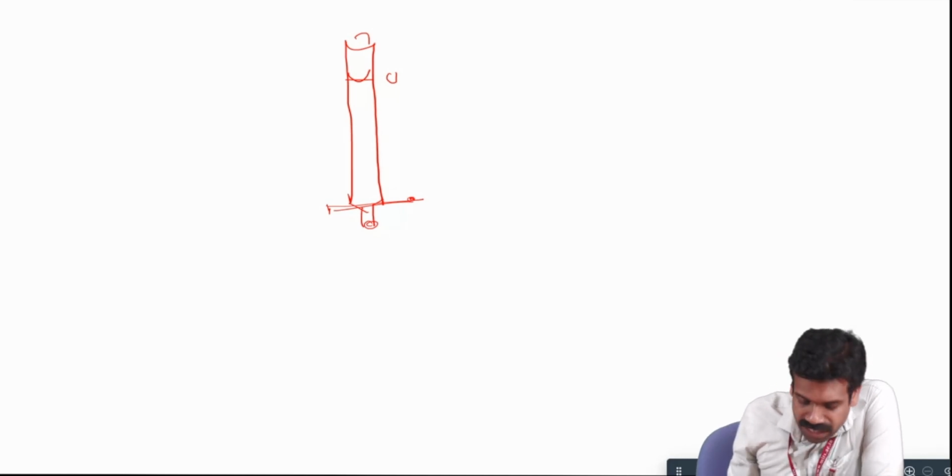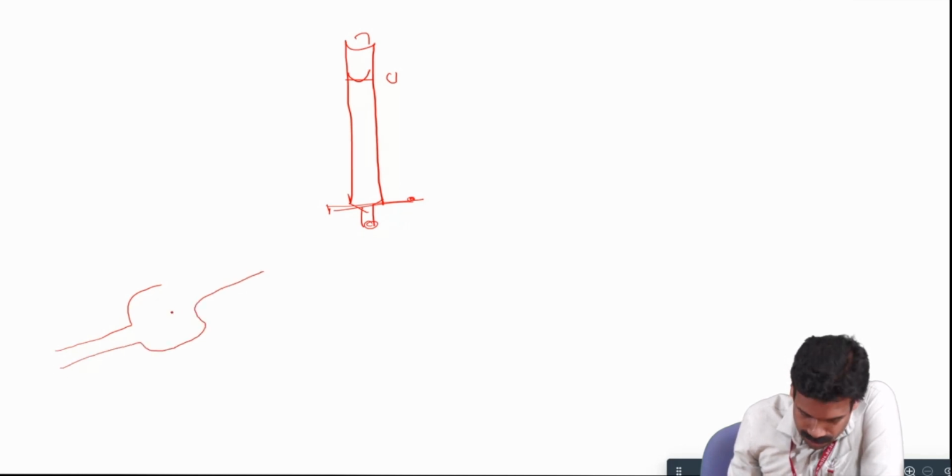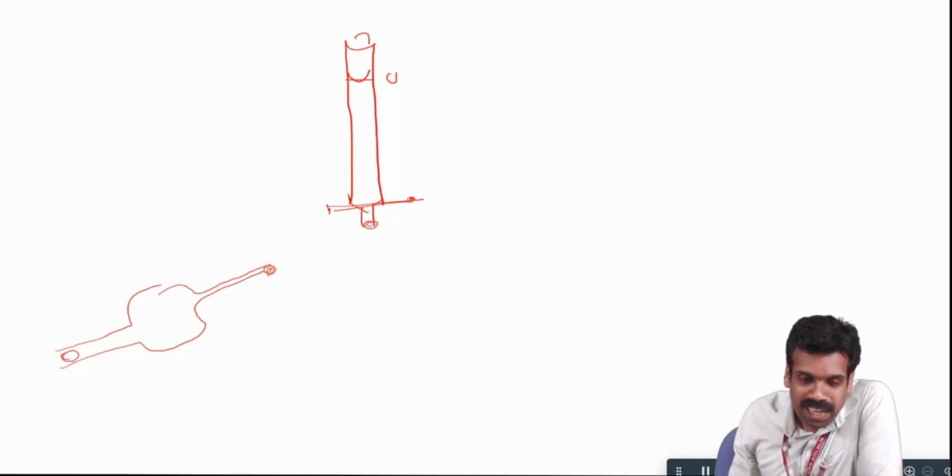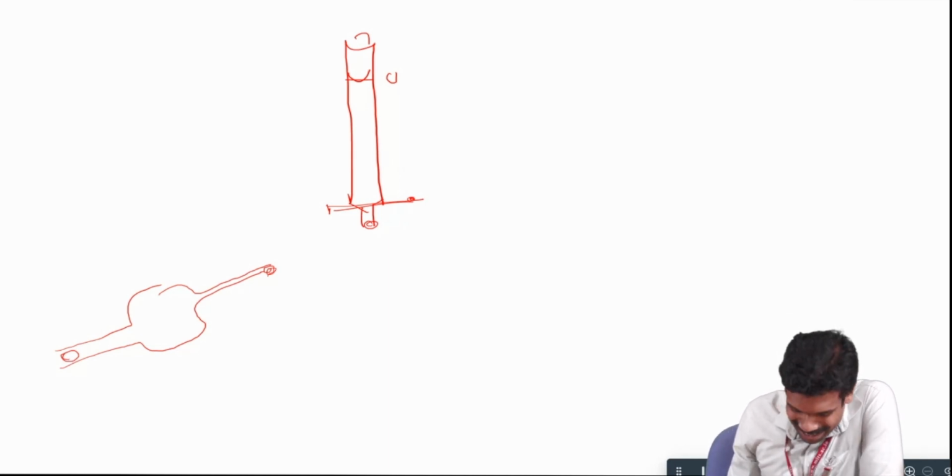In addition to this, you also require a pipette. The pipette will be something like this. Again, I hope you can understand that.